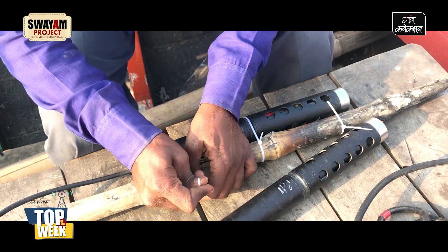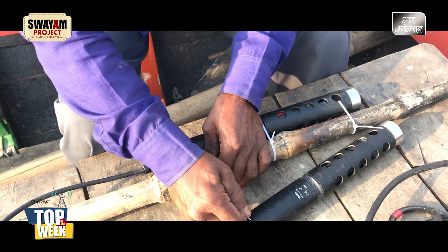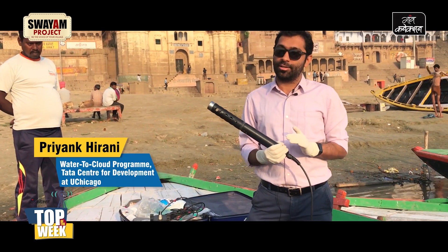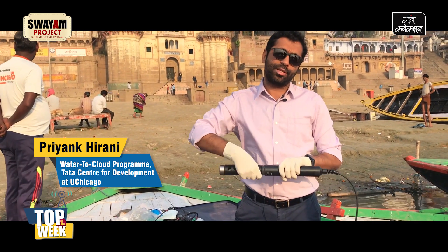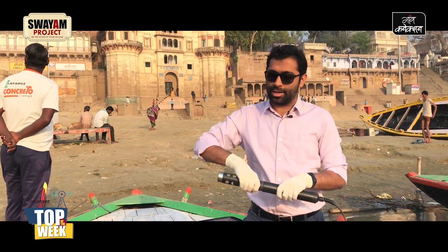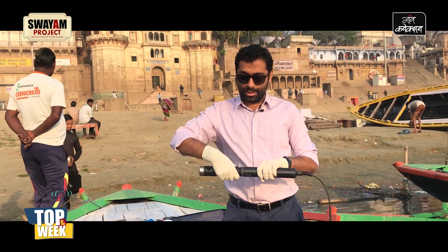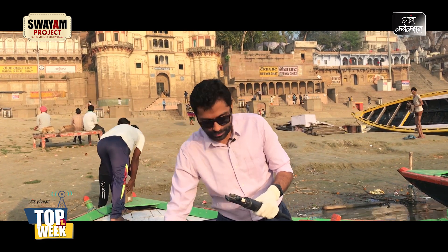I'm going to be displaying some of the sensors that we use on our board experiments at the Water-to-Cloud project. The first one is a HANA HI-9829 sensor. It measures a bunch of different things — it has a pH probe, a dissolved oxygen probe, and electrical conductivity and turbidity measurement available.